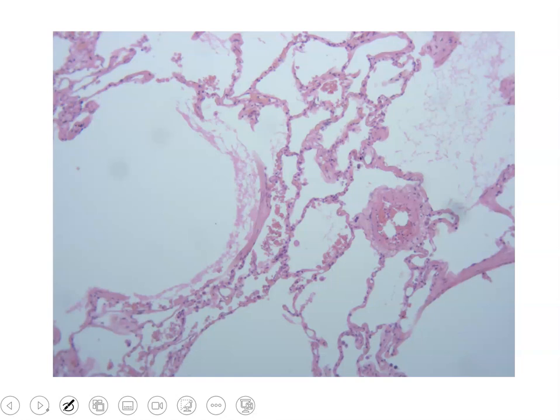So remember, on the practical exam, you will be asked not just to identify the epithelium, but you may be asked to identify a function of that epithelium. We know simple squamous epithelium, important for not only filtration, as we saw in the kidneys, but of course the exchange of our respiratory gases.